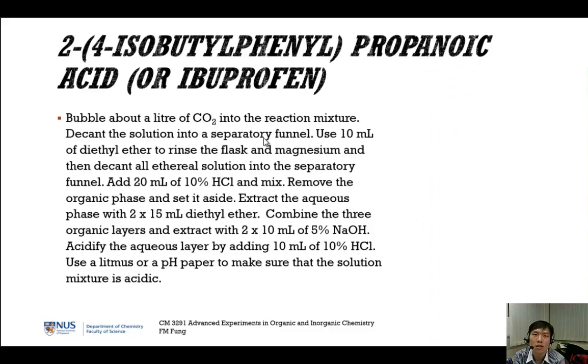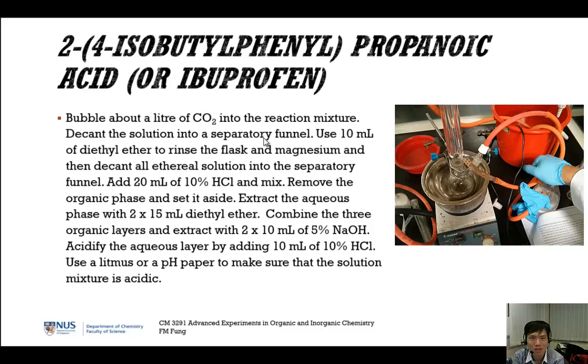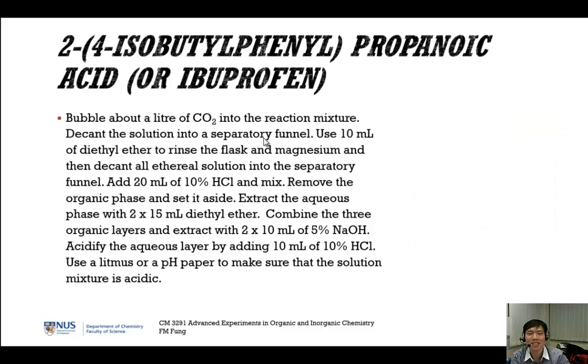We know that CO2 prefers to be in the gaseous state. You learn from the phase diagram of CO2. At RTP, it is CO2 gas. So now you are forcing it under high pressure to CO2 dry ice. Of course, when you add any liquid, it will just sublime quickly, okay? So you put your hand on top because you want to transfer all the CO2 into your reaction mixture, and if it feels a bit cold, okay, just lift your hand a bit and put it in again, intermittently. Don't worry, I will demo in the class in the lab.